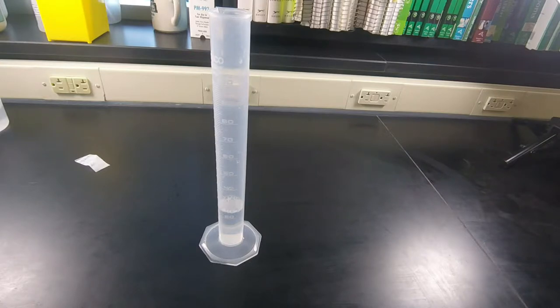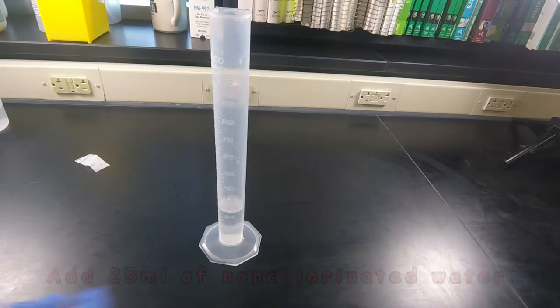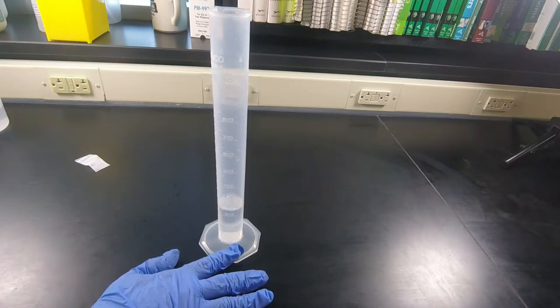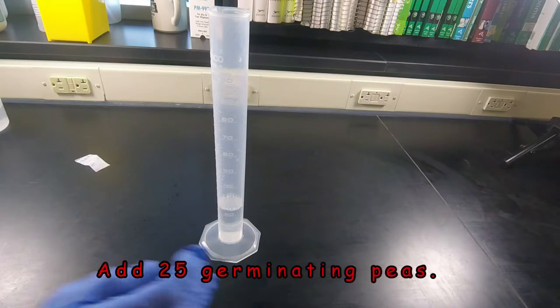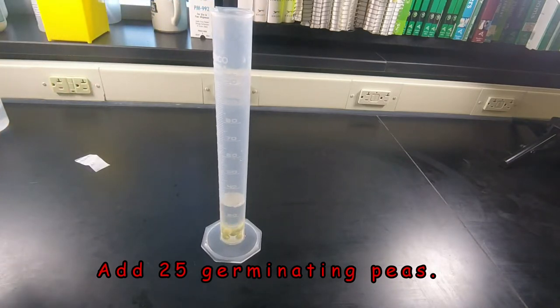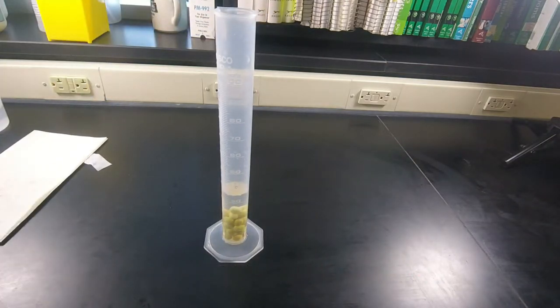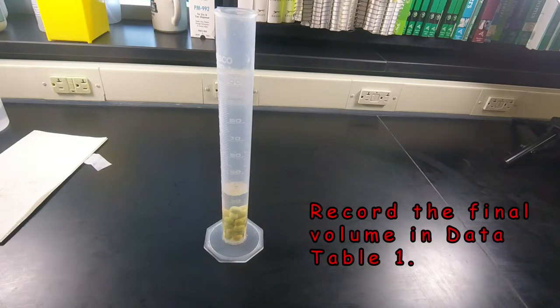The next step is setting up the peas and the beans. Add 25 milliliters of your bottled water to the 100 ml graduated cylinder, which I've already done here. Then we're going to drop 25 of your germinating peas into the graduated cylinder. Observe the final volume after you've added the peas and record this value in data table 1.